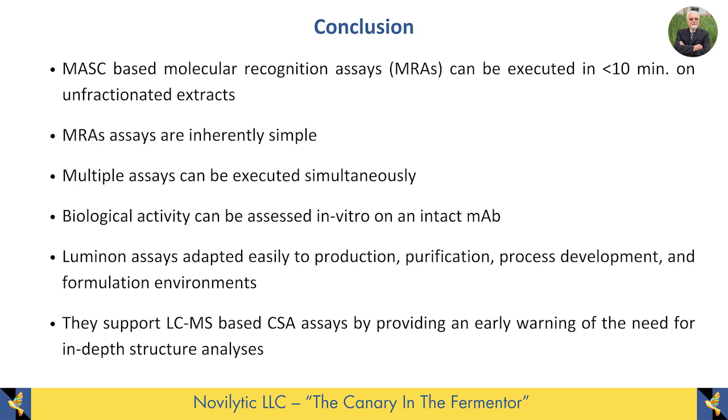in production while you're actually producing the antibody. You can use them while you're purifying it. You can use them in process development as you're discovering the antibody. And finally, you can use them in formulation. And interestingly enough, not generally recognized, is that even when you're putting a therapeutic agent in the bottle, then it goes to the patient, that you put them in at a high concentration and so forth. That can change the efficacy of the molecule, so you even need to assay efficacy and safety at that point. And that's why a very simple assay is very important.